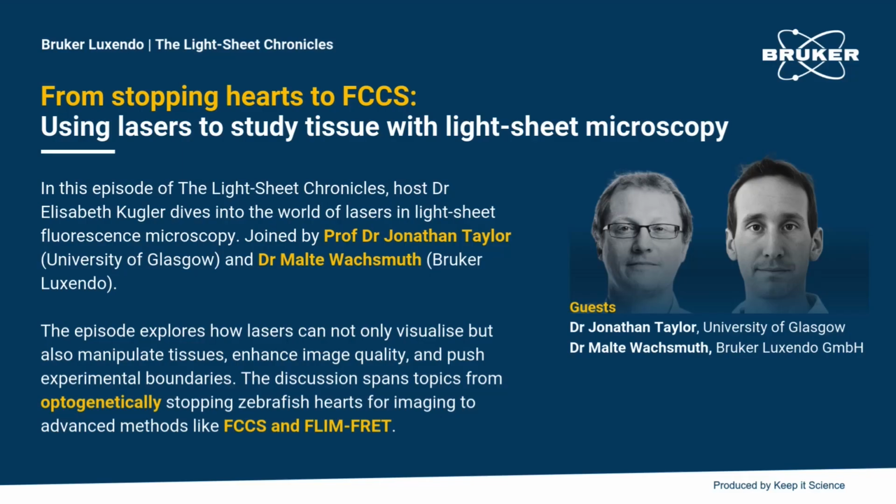On the other hand, you can look at an entire cleared mouse, or you can look at expanded tissue to have kind of super resolution like impact. I think the one thing that I find most fascinating is really the versatility. This keeps growing and keeps being a challenge.